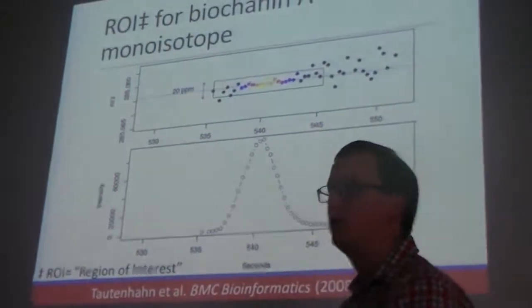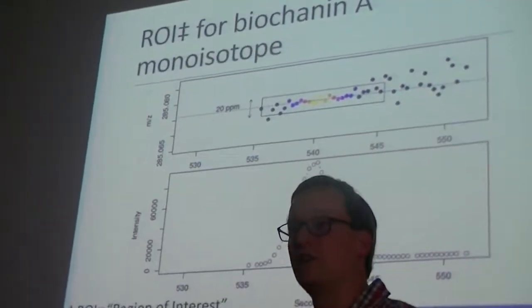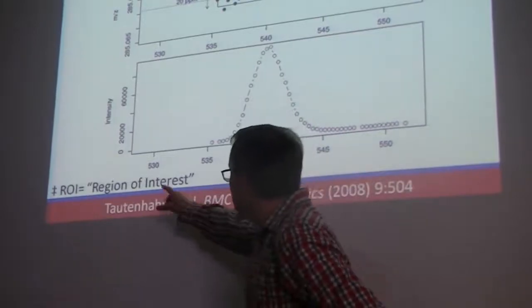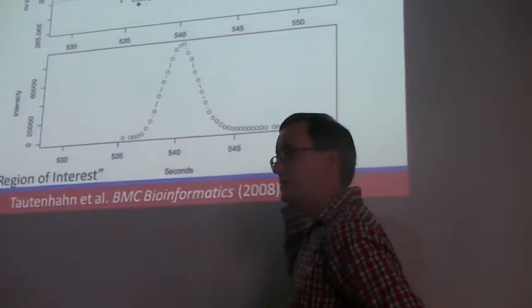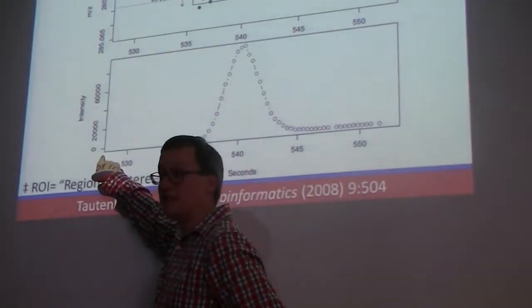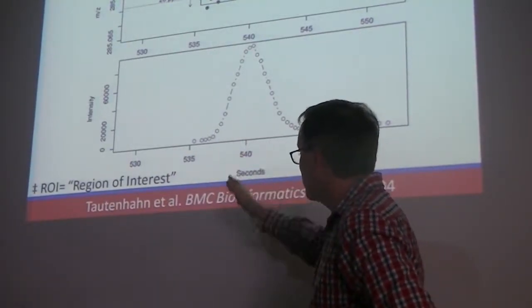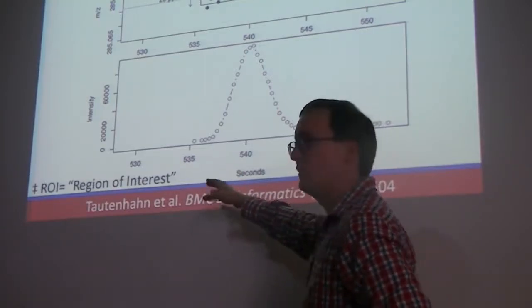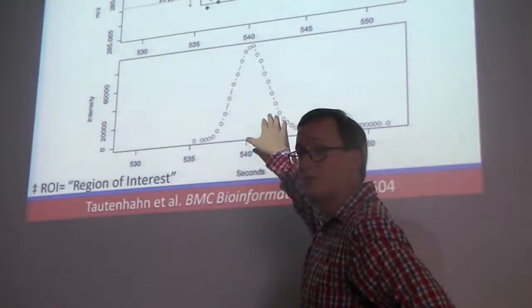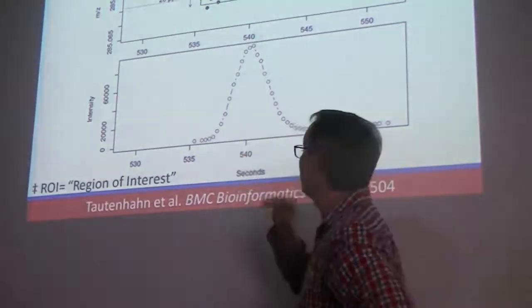So one of the first things I was going to demonstrate in the software this morning was the detection of a region of interest. We are looking at differences in retention time. This is how many seconds it's been since we started this experiment. On the y-axis, we have the intensity that's been measured. If you imagine that the instrument is sampling at more than a hertz, here we've got multiple measurements per second, we're getting different measurements of intensity out of this. And as a result, the chromatogram that comes out is beautifully smooth. That's a lovely looking chromatogram.